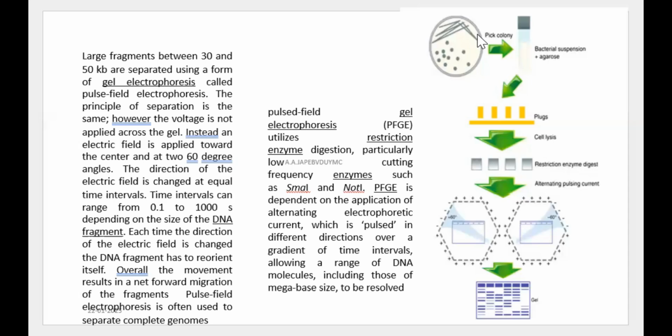So you are going to fragment the DNA in the plug, right? You have not extracted the DNA, you have not processed the DNA, you have taken the colony, it is put into the agarose plug, and there you are doing the restriction digestion, or you are exposing that agarose plug to treatment such that the cells are lysed, the DNA is released, and then the DNA will be exposed to electrophoresis.